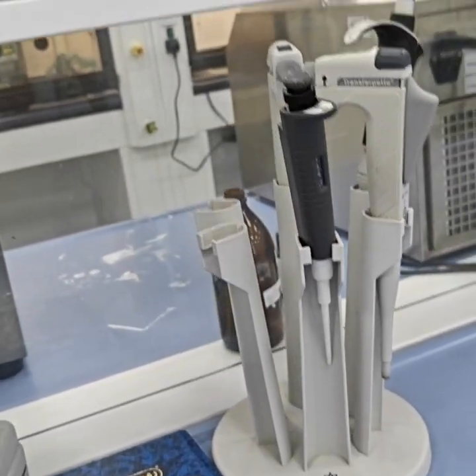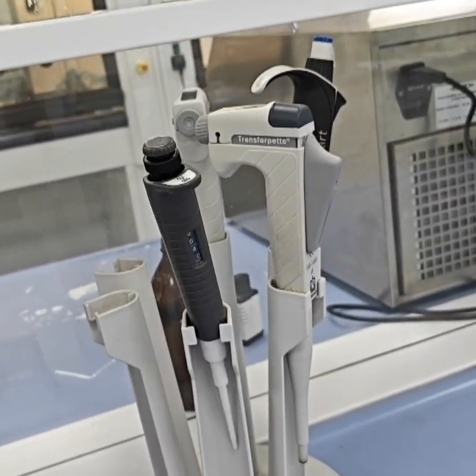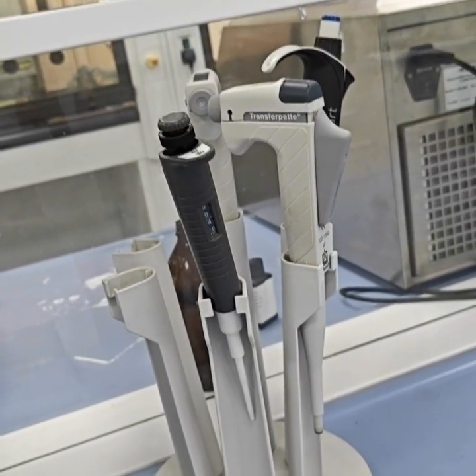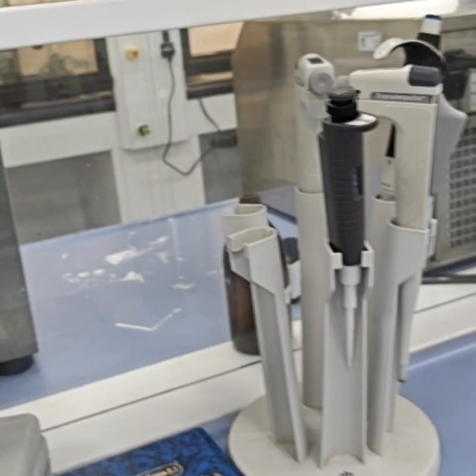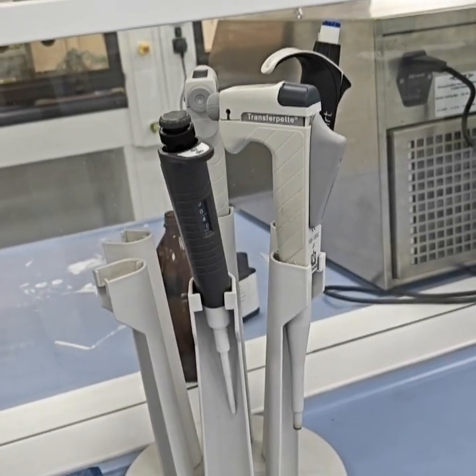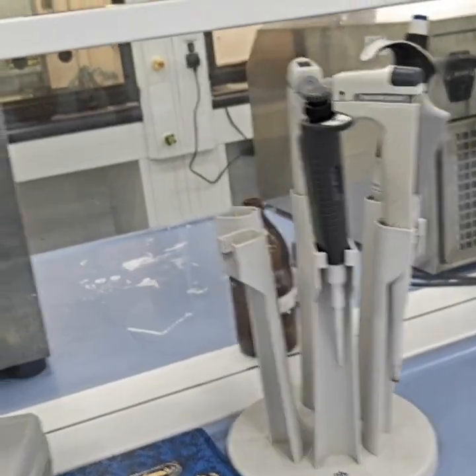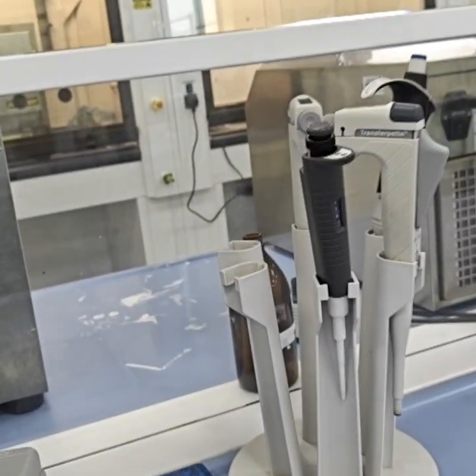For the nutrients, you can add acid and store at 4 degrees C for 48 hours. For suspended solids, you don't need to add any preservative, and the preservation should be done at 4 degrees C, and the holding time could be 7 days. And if you're analyzing pH, make sure you calibrate your pH meter.